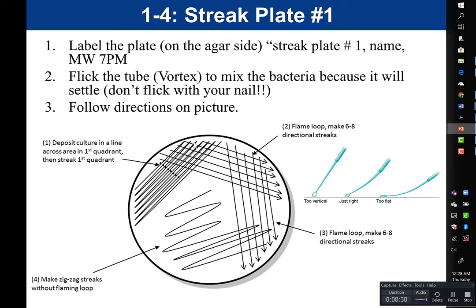Turn on your Bunsen burner and make sure you have your inner blue cone — that's the hottest part of your flame. You're going to take your loop and, holding it like a pencil, flame it starting at the base and working towards the tip. Do not stick your loop directly into the broth while it's still hot — if you take that red-hot loop and stick it directly in the broth, you're going to kill the bacteria. So after you flame your loop, hold it close to the flame and let it cool.